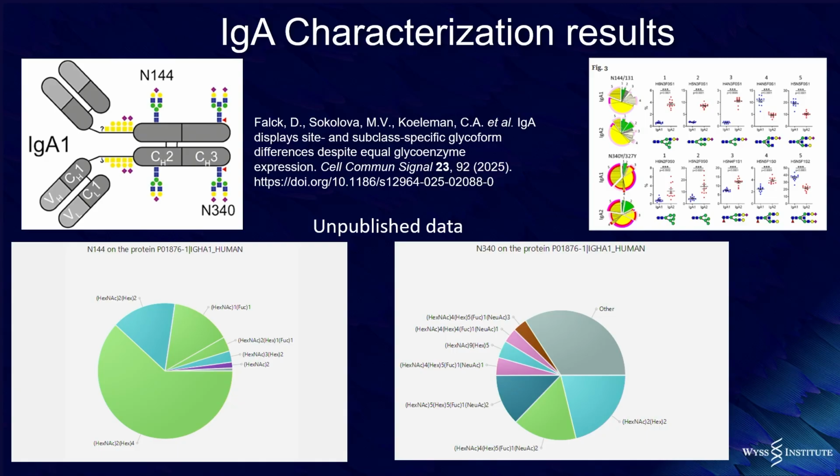Again, there's data that has been recently published, and then our own data that we just obtained. It's not published yet, and you can see there has already been a publication showing the regions where the typical N sites of glycosylation are being picked up, and how those look. I put a figure there from that publication. Please go ahead and use the publication if you need details from it. But our data, just unpublished, below, and again, we do see exactly the same site.